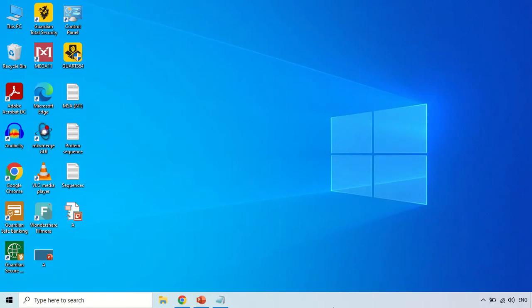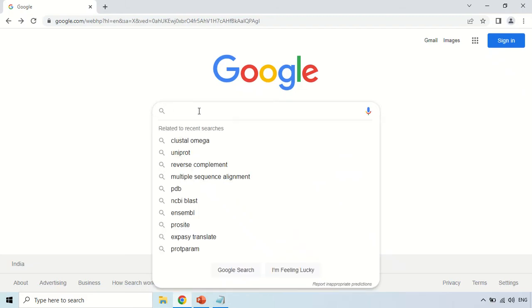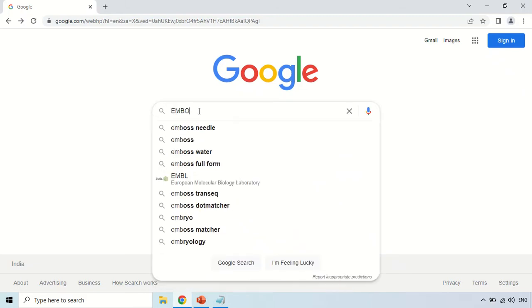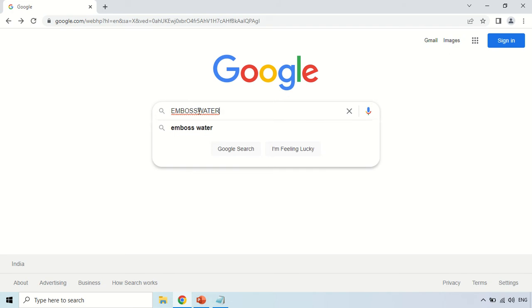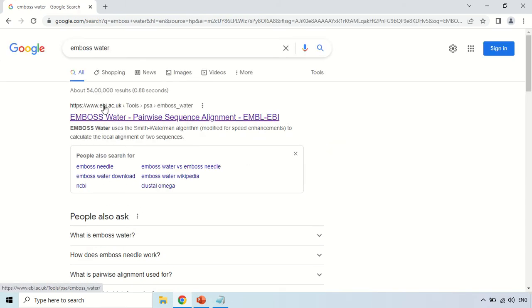To open EMBOSS Water, just open your browser and search for the tool. The first website that appears is www.ebi.ac.uk. This is the main website because EMBOSS Water is a tool of the European Bioinformatics Institute, which is why it is EBI.